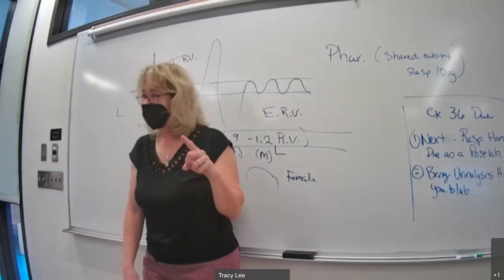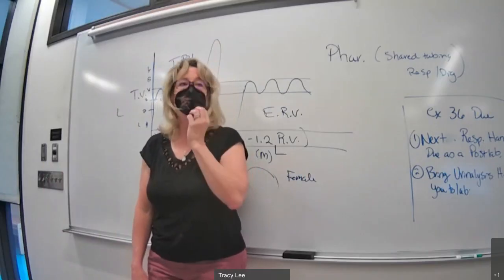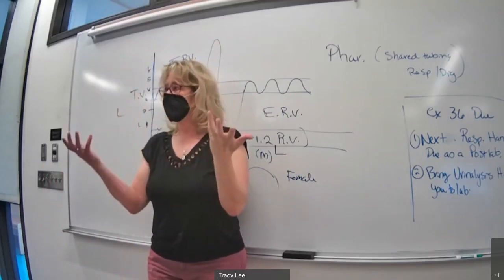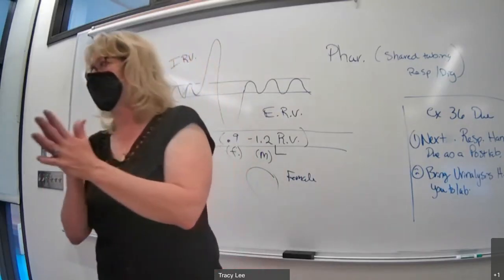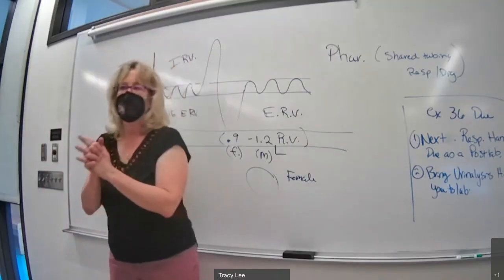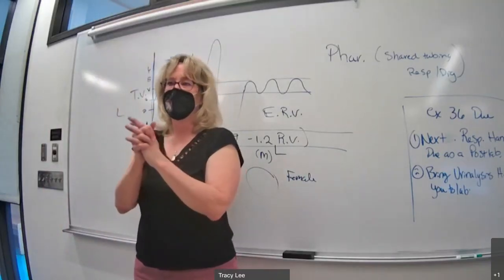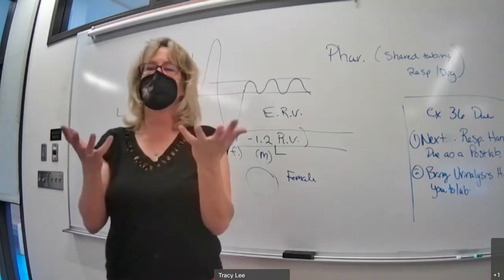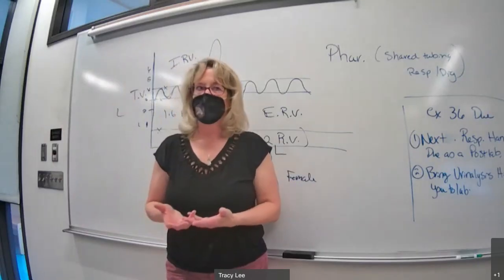You should know all of the different tissue types in your respiratory system. So upper respiratory system, what's going to be the main objective of my tissues in the upper respiratory system? To protect. So how's it going to protect? What kind of structures are we going to see in our tissue to protect? What are we protecting from?